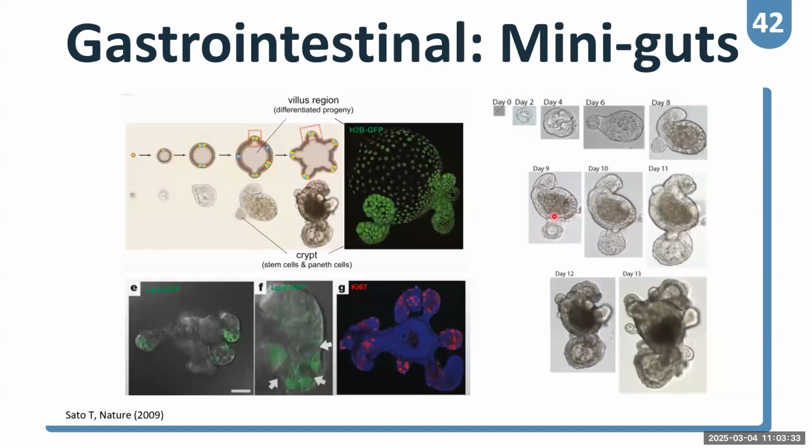They try to bud out from this origin organoid. And as I mentioned to you, we try to set up a standard to culture the organoid, but it depends on the type of cancer and also on each patient. You can see, for example, in this type of cancer, they use several days to form a structure like this, okay? And you have to monitor every 2 or 3 days to observe if it is suitable to test the drug or for further study or not, okay?